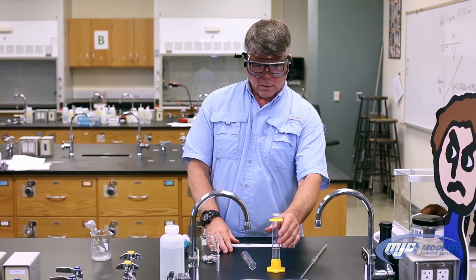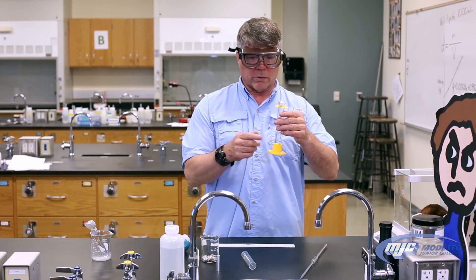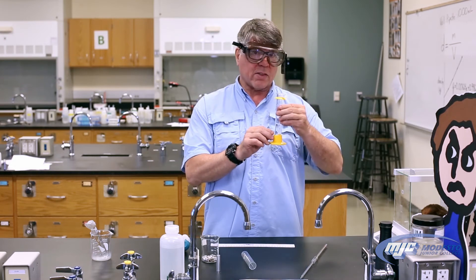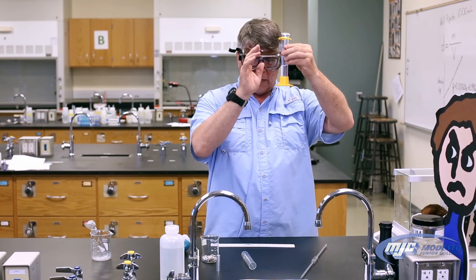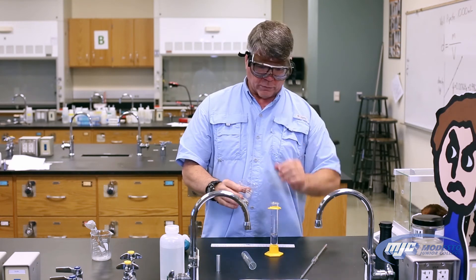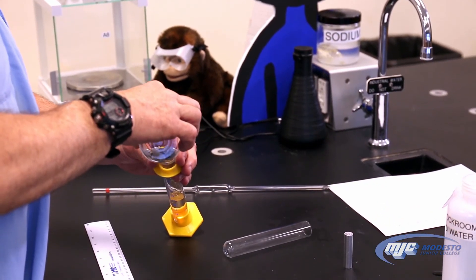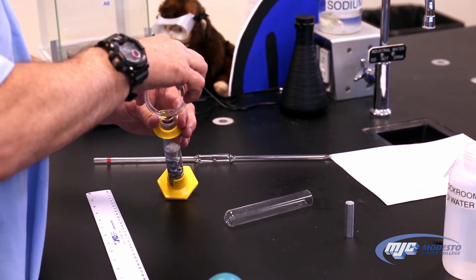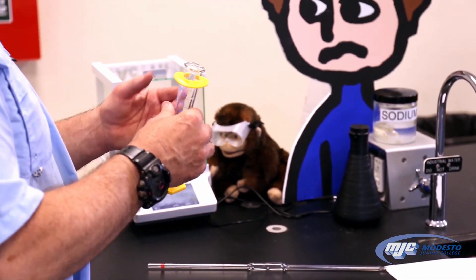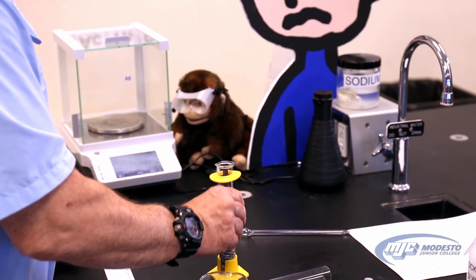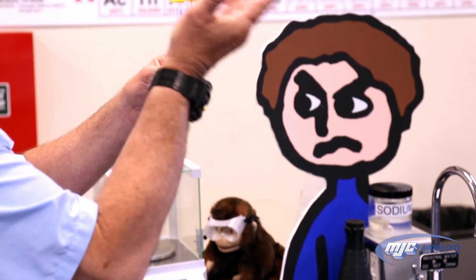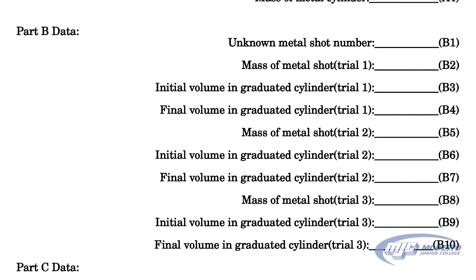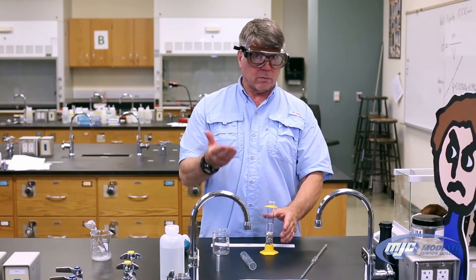Once the metal shot is weighed and in the beaker, take a graduated cylinder and add tap water to about halfway. Read the initial volume — one place past the decimal in milliliters — that's B3 for trial one. Then carefully pour the metal shot into the graduated cylinder. Be careful not to splash water out or break the cylinder. Gently tap it on the counter to release any trapped air bubbles. Read the new final volume — that's B4. The difference between initial and final volumes gives you the volume of the metal shot. Repeat for trials two and three.